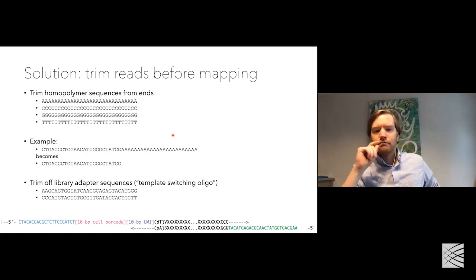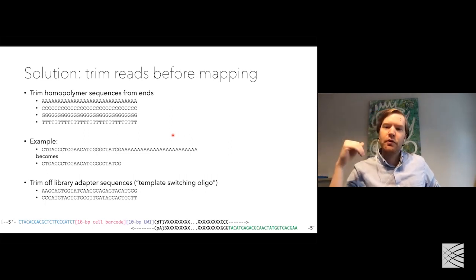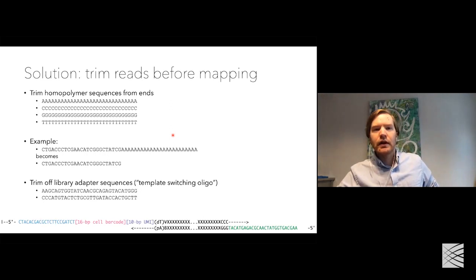And if you do sort of an in silico experiment where you trim and you don't trim, compare the count matrices that you get, see what the differences are. And I think you'll be satisfied that read trimming is a useful idea, and that the things that change in the count matrix are things that if you look at IGV, they probably should be changing. But I would encourage you to try it both ways and see what the difference is.